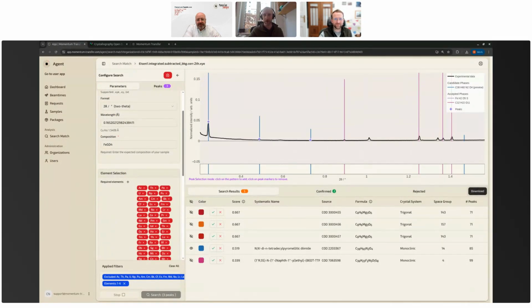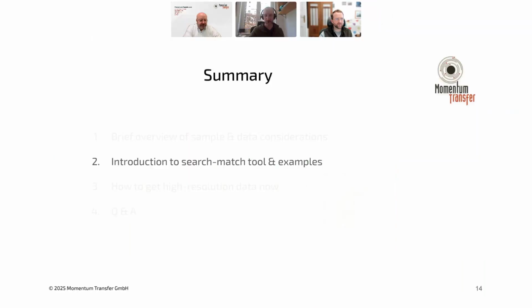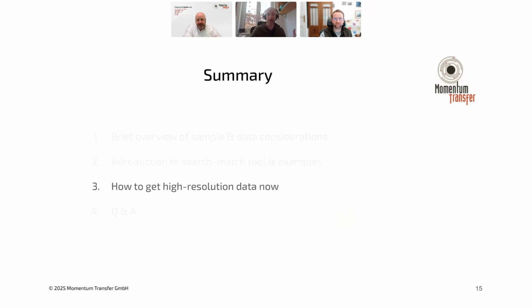So I think I went a little bit longer than I wanted to, but I hope that answering some of the questions was helpful. So I would then go back and let Sebastian discuss a little bit more about the process for those of you who want to actually collect some data to work with on this. Maybe you don't have your own instrument or you want to see how the data quality can help improve it. And then I think we can go back into answering the rest of your questions. Yeah, we have 19 questions already, so we'll stay a little longer so everybody can stick around.